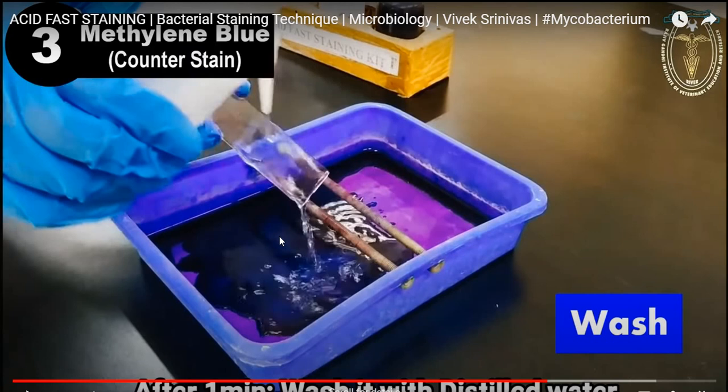counterstain. Then also make sure you remember which side of the slide has the smear. Now, the stained smear is ready for microscopic examination. Okay? You might mistake it for the other side of the slide. Just make sure the stained slide is placed over the stage with the smear facing up. Examine the slide under 100x oil immersion objective microscopy.